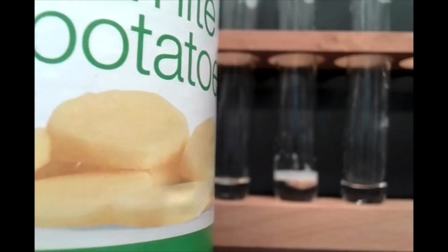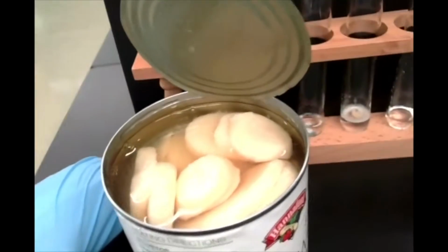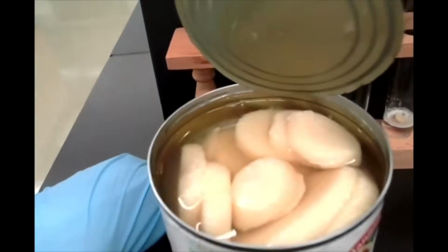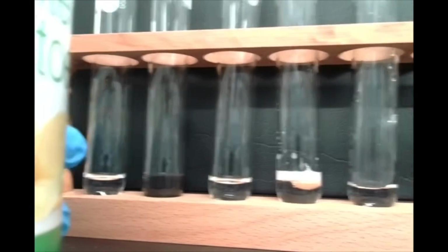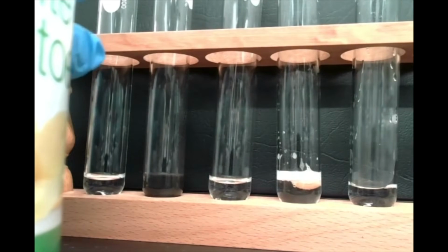All right, so here we've got our can of potatoes. These have been pre-boiled before they were canned. So you can see we've got our slices of potato here. I'm going to go ahead and cut out a chunk of one of these with a spatula and add it to test tube number 5. And we'll go ahead and observe what there is to observe. I'm very careful here to use a fresh spatula.